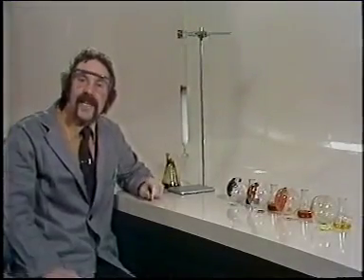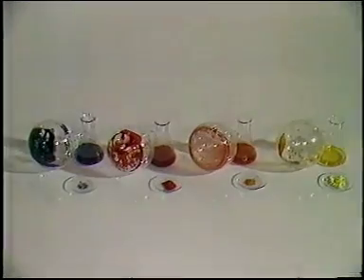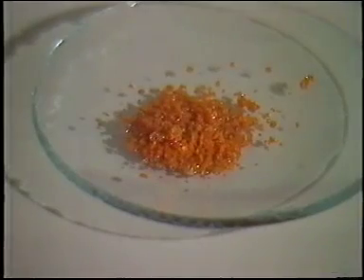Column chromatography is an immensely powerful technique, and although it can be automated for the collection of fractions, the simple procedure that we used here is perfectly adequate. Further purification of these evaporated fractions yields the beautiful crystals we have here.